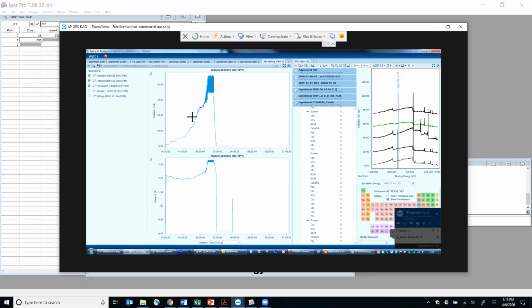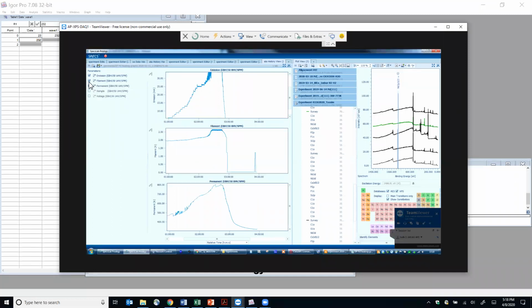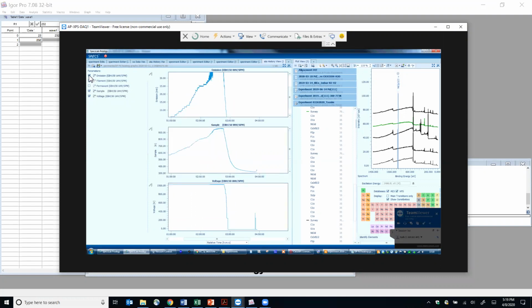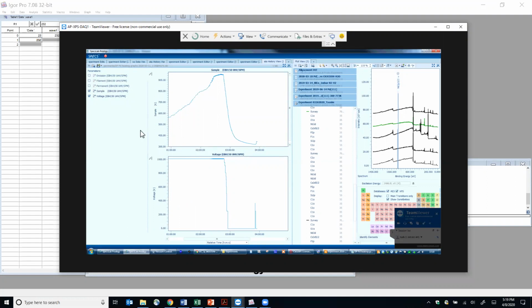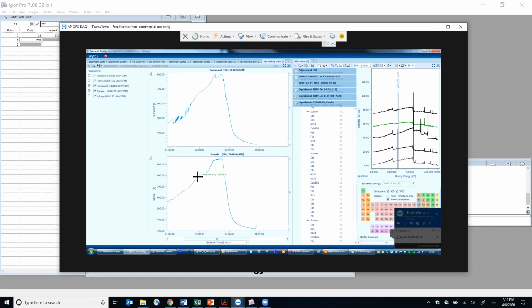The goal of this experiment, for example, if I put it here, you see, you can read the temperature of 785. This is the temperature in the sample. The sample is hotter than the temperature in the manipulator, but I want to see what is the correspondence of this. So it's something like here.